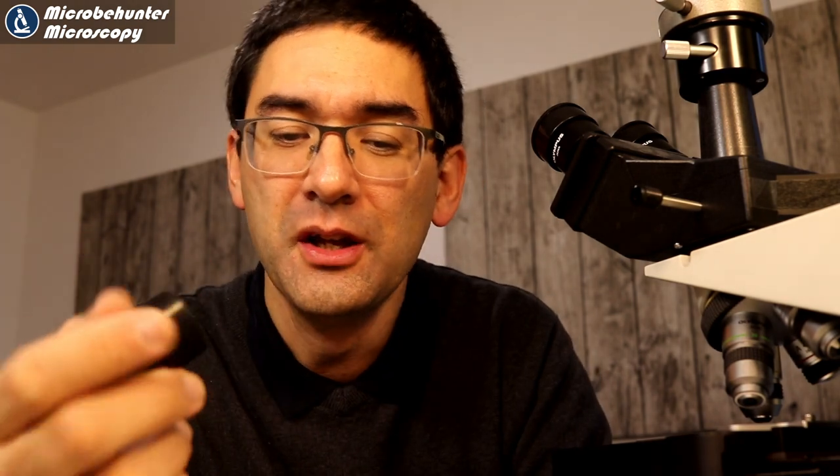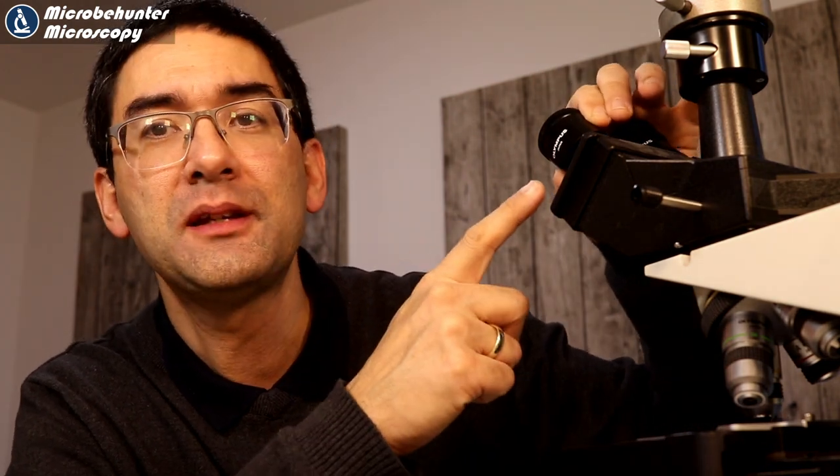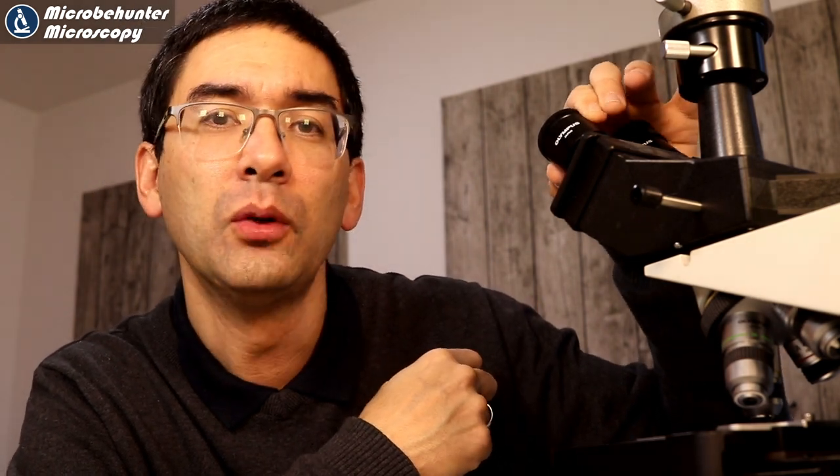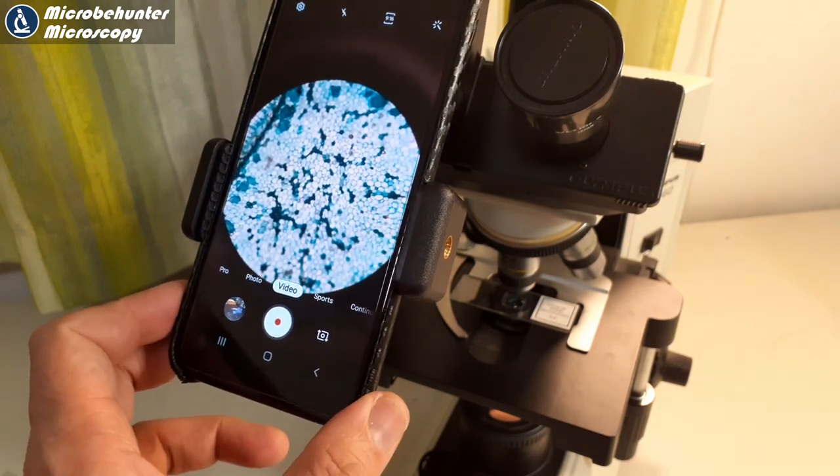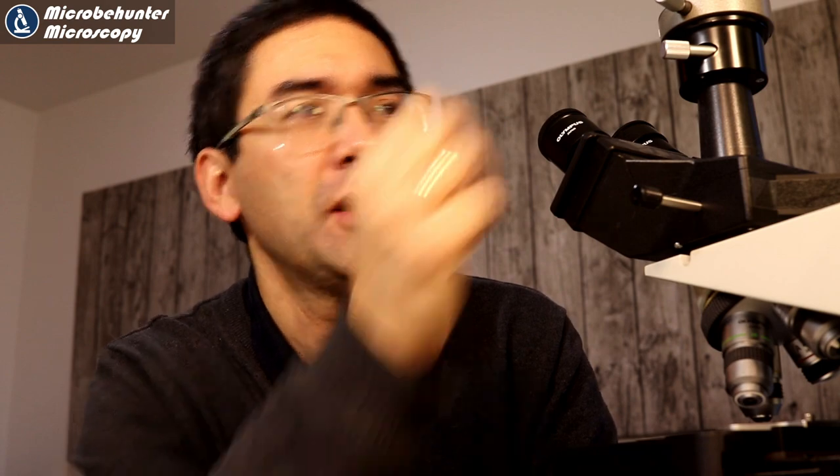You can see that both of them have advantages and disadvantages, and I wouldn't be able to say which one is automatically better. Both of them are of excellent quality and both make photography through the microscope possible in an easier way. Both of them, in the nature of the system, have a general disadvantage: there is always a little bit of tolerance when you have an eyepiece in the microscope, so there is a small wiggle, and this small wiggle is already enough to get the whole thing a little bit out of alignment - even a fraction of a millimeter is enough for things to go out of alignment quite quickly.